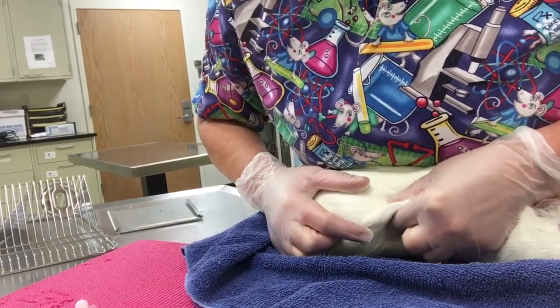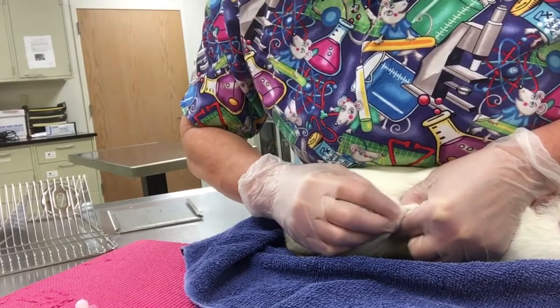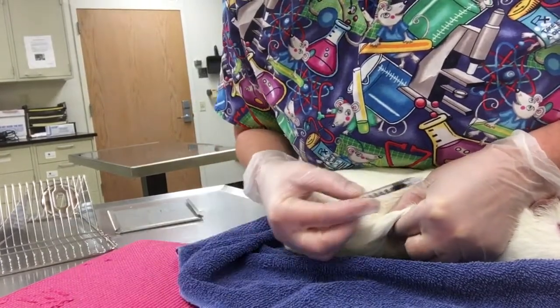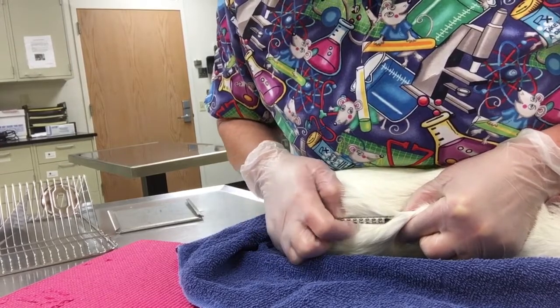But guinea pigs have very tough skin, so I will then roll the skin, have a hard surface to push against, alcohol, place my needle — no need to aspirate for an ID — and inject.